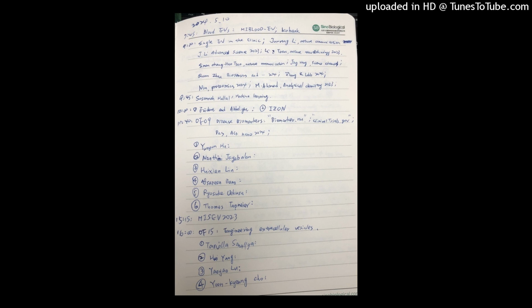It's just sometimes one is in a situation where there are lots of disease samples in a biobank stored as plasma, and then mostly their healthy controls would probably be people from the lab, and it's going to be probably stored as platelet poor plasma. Do you think it's comparable? I mean, can we really combine samples stored as platelet poor or platelet free and plasma? What do you think yourself?